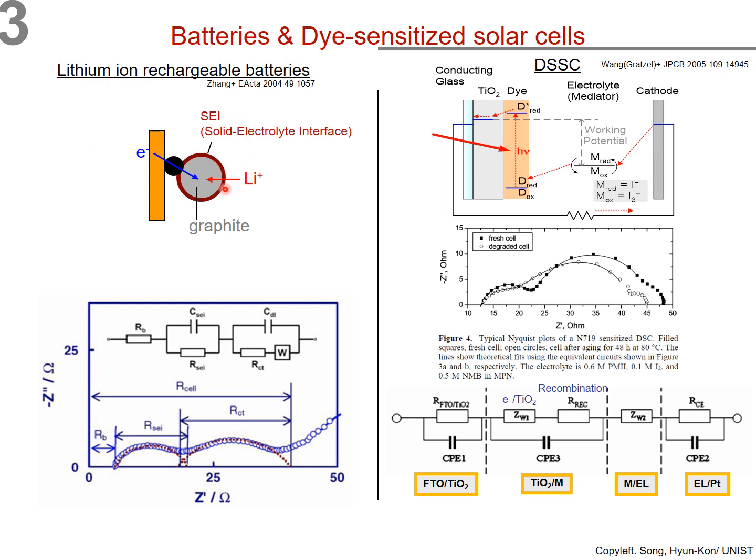This is the anode for the lithium-ion batteries. This is a copper plate, which could be used as the current collector or electrode. On the copper current collector, we have two things. Graphite is the active material into which lithium ion is intercalated during Faradaic reactions. The other thing is carbon black. Carbon black provides an electric conduction pathway from the current collector to the graphite.